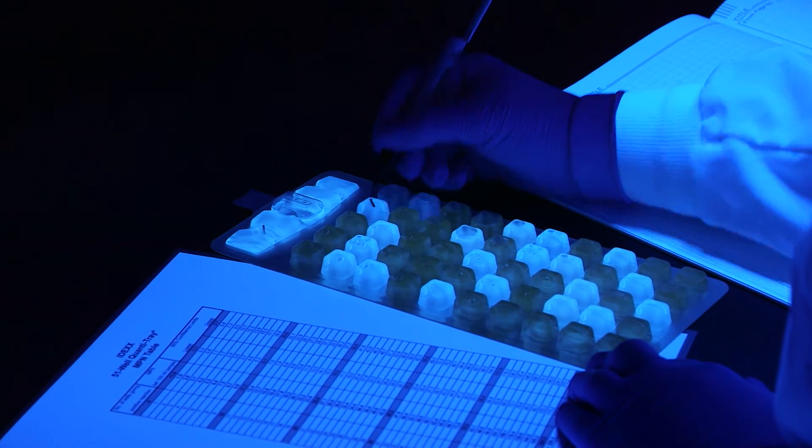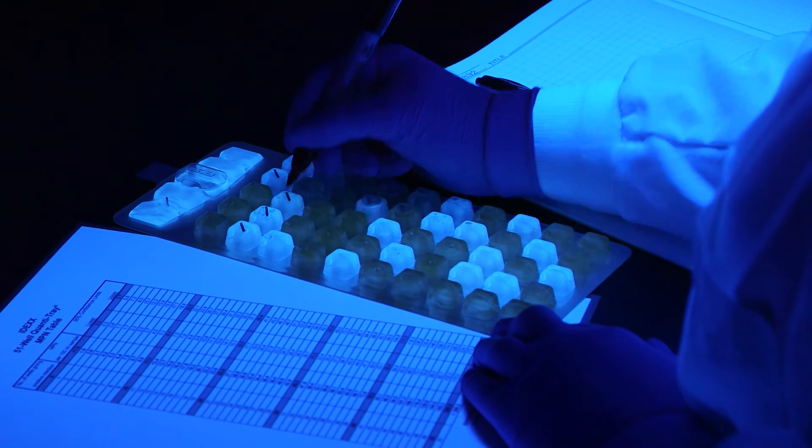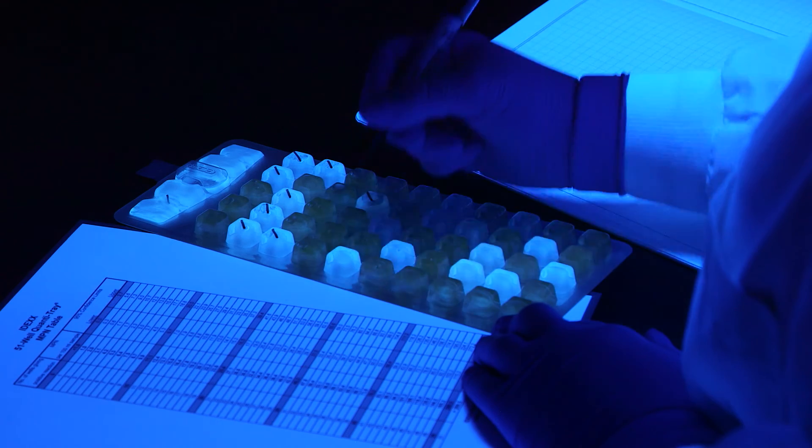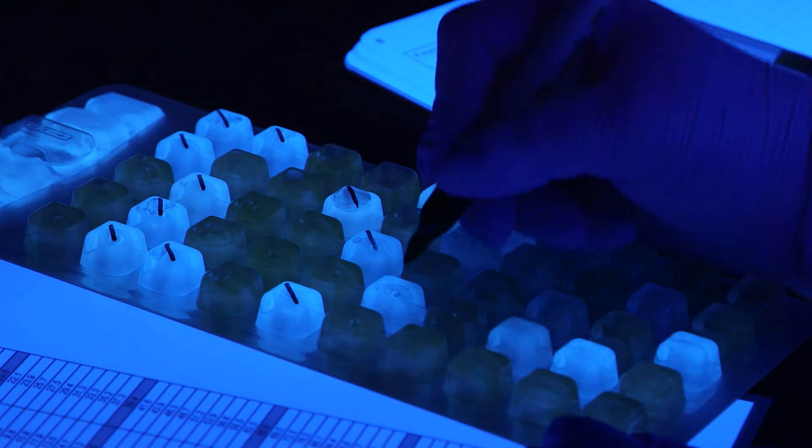After incubation, view the Quantitray with a UV lamp in a dark environment, shining the light away from your eyes. Keep the light within 5 inches of the tray. Mark each blue fluorescent well with a permanent marker, including the large overflow well.